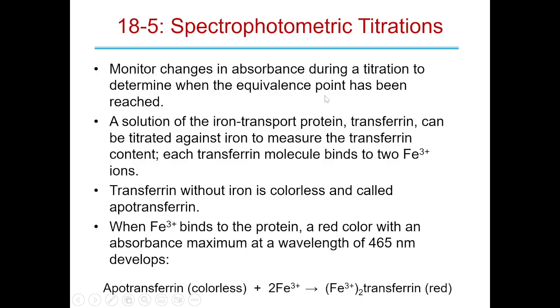You can also get really complex in your setups. So remember we were talking about Gran plots, right? And so you can actually use this spectroscopy with a Beer's law to determine the concentrations as you do the titration. So literally add some. This is the new concentration. And you can even do standards like that. So you can do a lot of complex stuff. These are not independent concepts that never merge together. This whole course is building up to give you tool sets that you can merge together to do complex measurements, or very accurate measurements, one of the two.